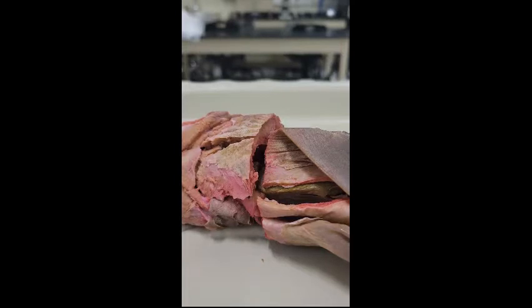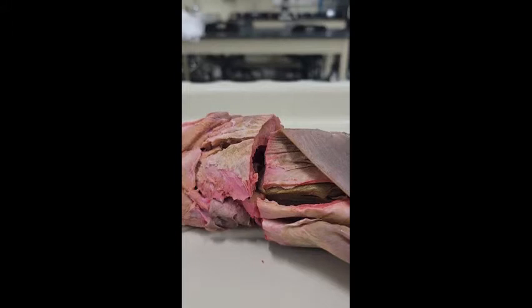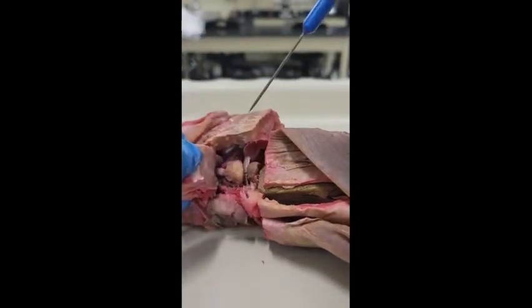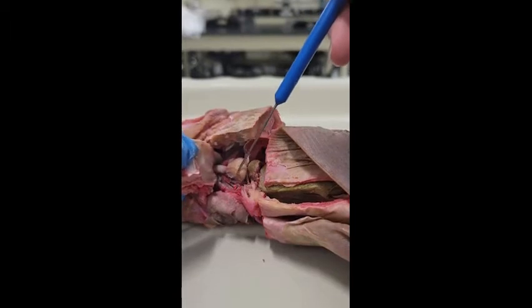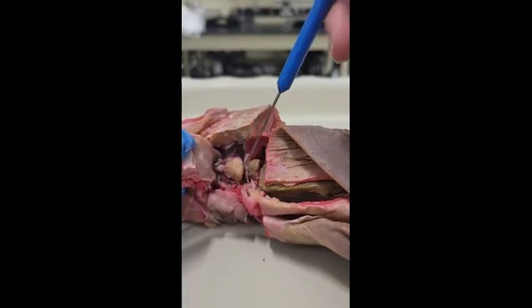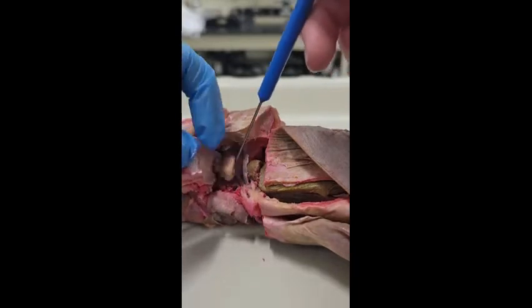So now we move into objective number 2, which is describe the shark's circulatory system, explaining the chambers of the heart and blood flow pathway. So we're going to take a look inside here. So this is our heart. The dogfish shark has a single circulatory system.